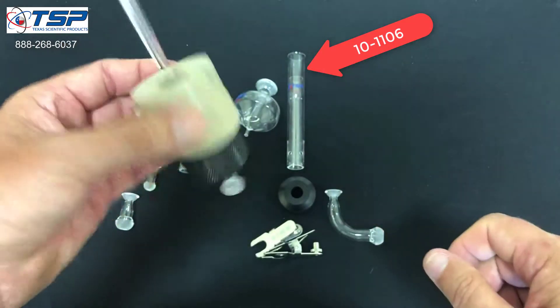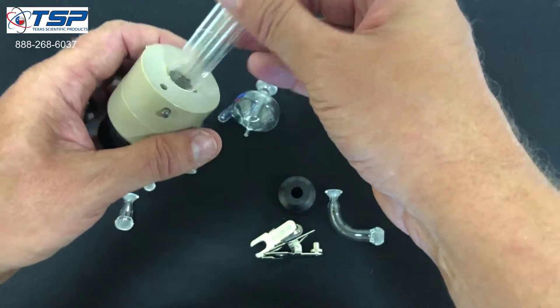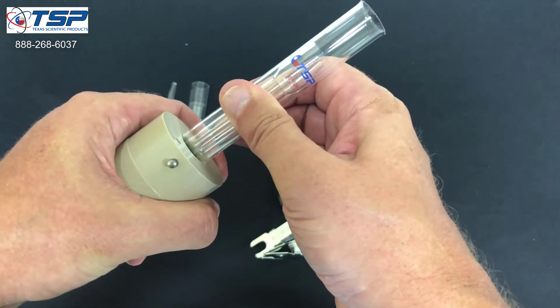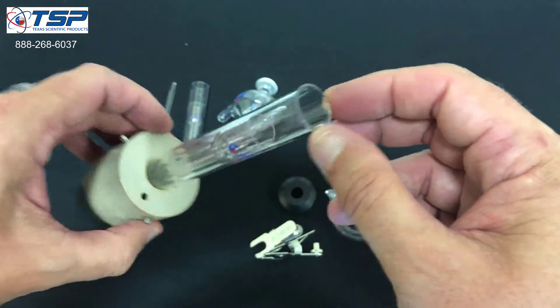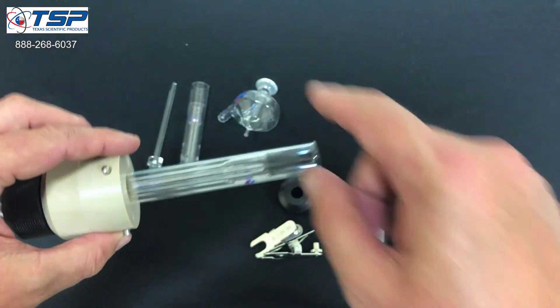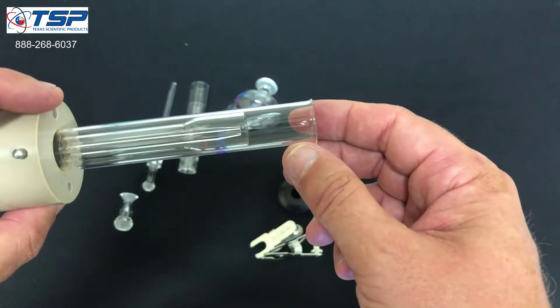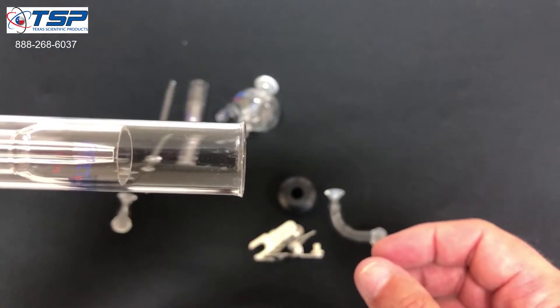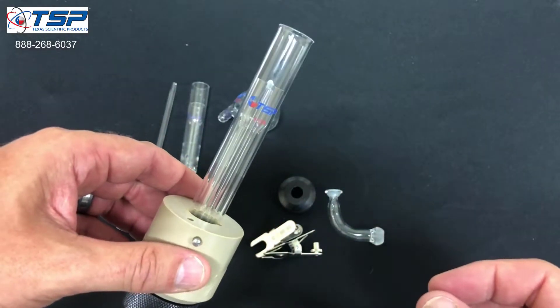The fit should be nice and firm. You're going to hear that pop again when the torch is inserted. You'll also notice with the axial torch that it's a little bit longer than the radial was, and it's got a flared end on it that you can see. That's how you can make sure you're working with the right torch body.